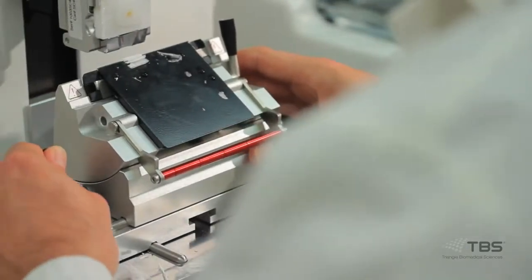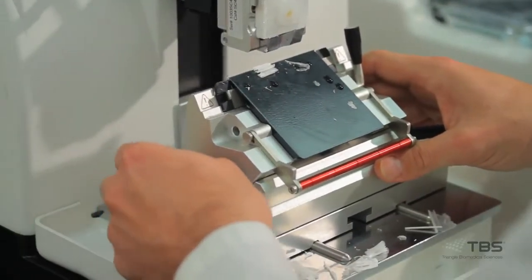A lateral displacement feature makes it possible to use the entire disposable blade without moving the actual blade itself.